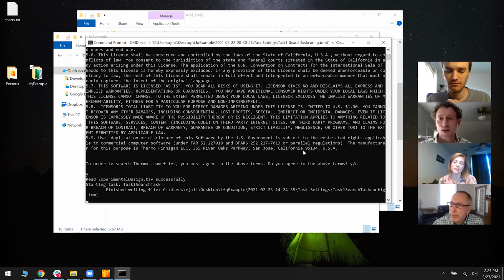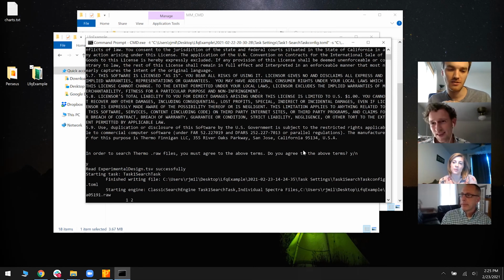Or free, sorry, subsidized is the word they want you to use. But let's say I wanted to use somebody else's resources to run 100 files. This is the way I would use Metamorpheus in a Linux environment, right? Just to crank through stuff. It's close. I'll show you a couple of options for Linux in a second.